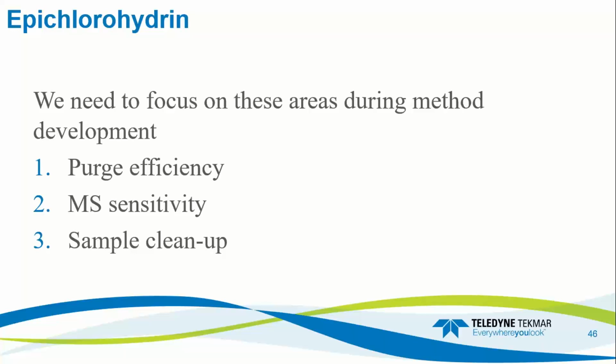For purge efficiency, we'll need to chill the sample because of how fast it breaks down. These calibration standards are also made in 10% weight by volume sodium chloride DI water to help with the purge efficiency as well.